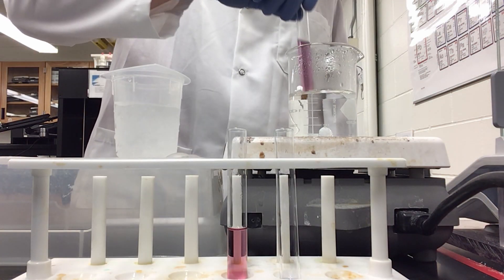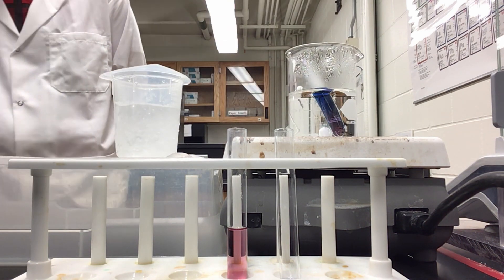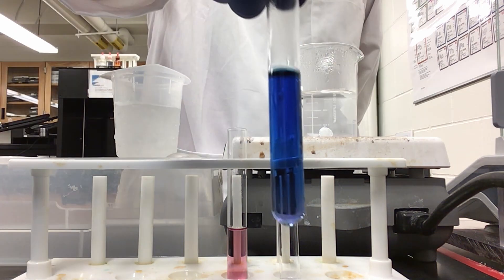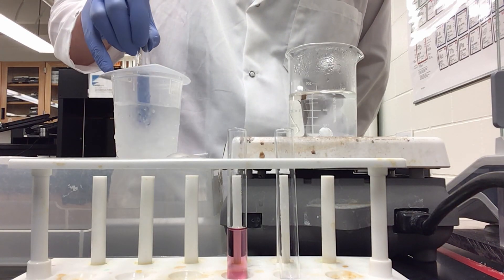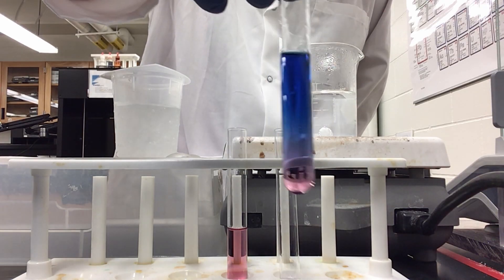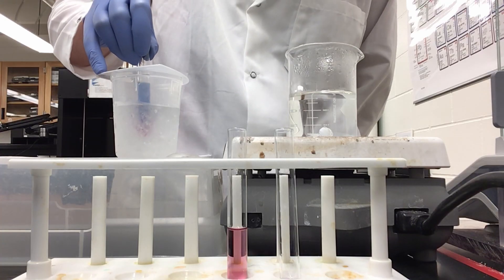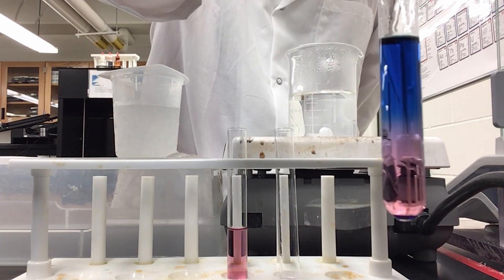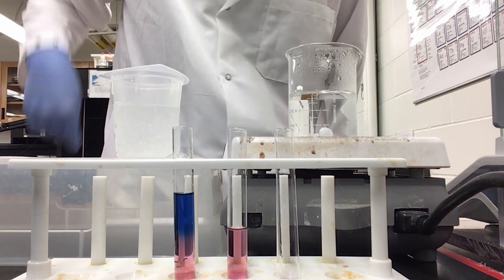Now I am going to take this purple solution and place it into my hot water bath, then remove it. Now I am only going to be putting half of the solution into the ice bath. As you can already see, we are starting to get pink forming on the bottom — even more has formed. And now we have a perfect half-and-half solution.